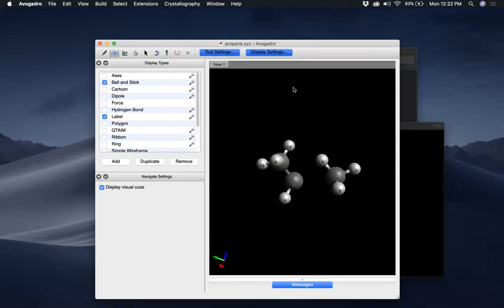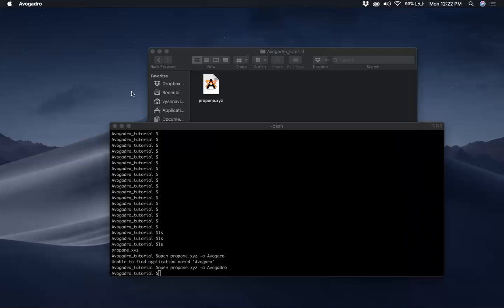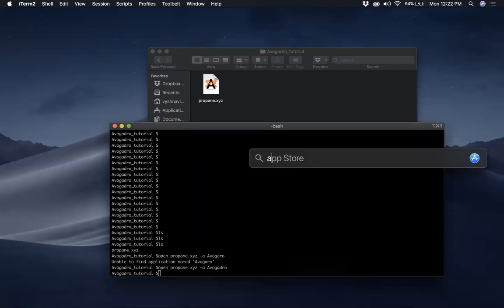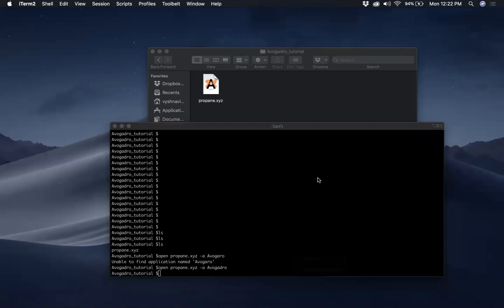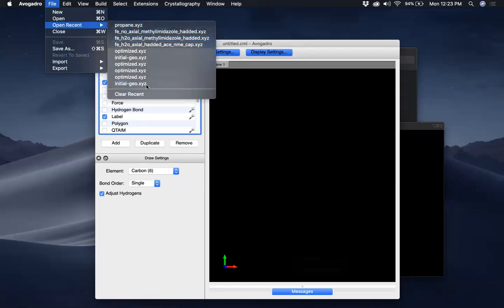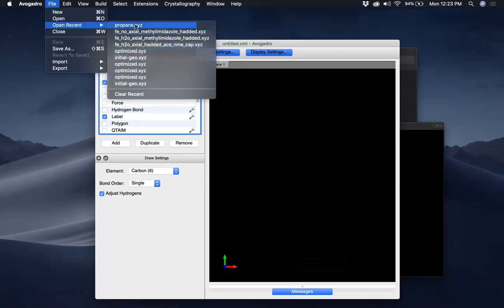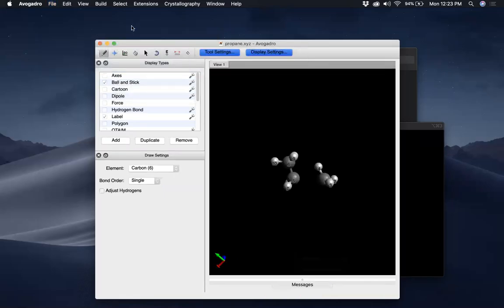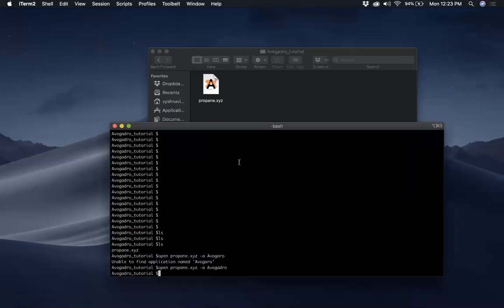This is how you save and open files. If you want to open a file directly from Avogadro, open Avogadro and go to File > Open Recent. These are some of the files I've been working with — in Open Recent you can see 'propane' right there. If you hit that, it loads the molecule from propane.xyz.